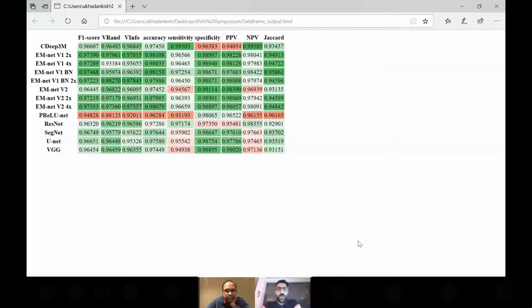Yeah, sorry. So one of the outputs is the data table HTML file.